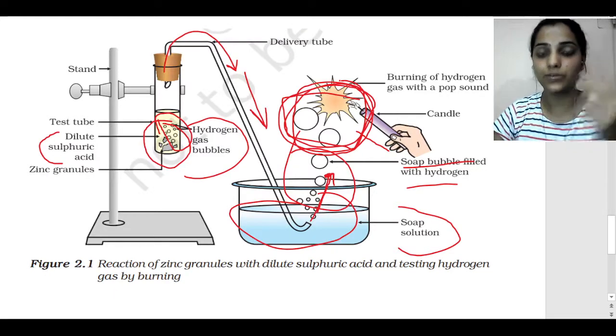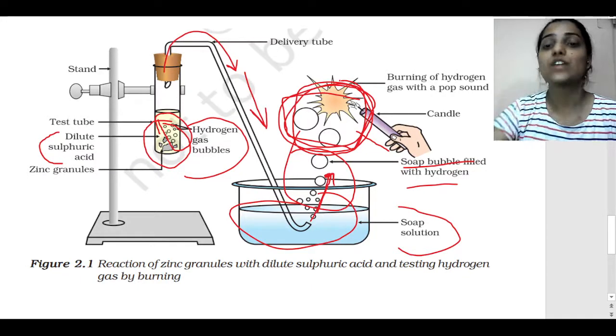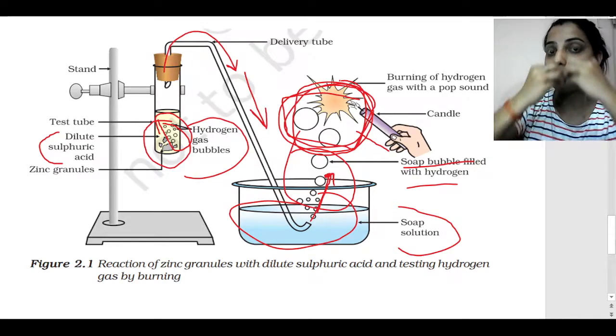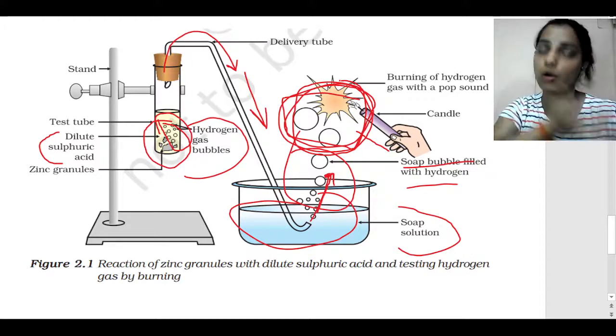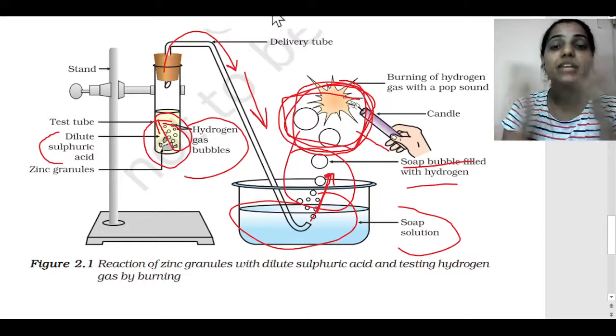Like, there's a pop sound like that. So if we take a burning candle near the bubble, we get this pop sound. See, yeah, we get a pop sound.